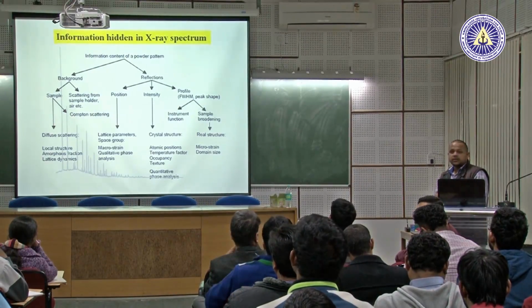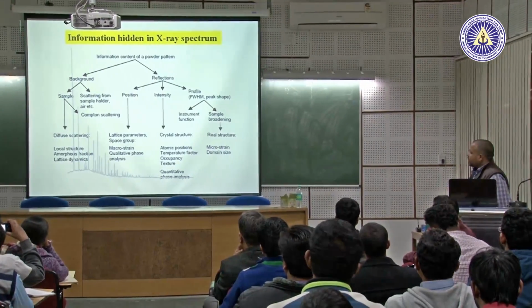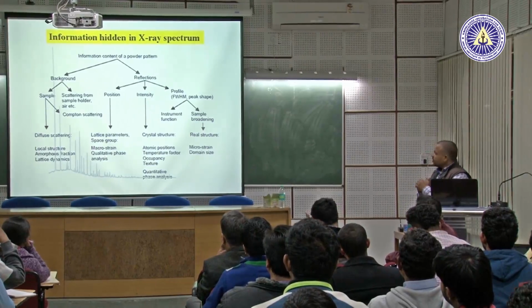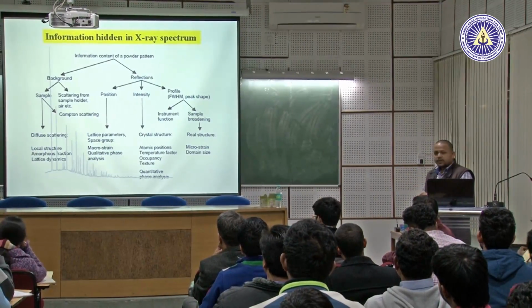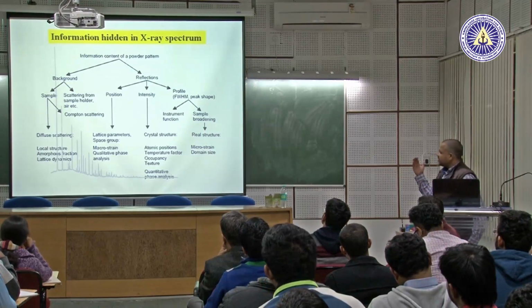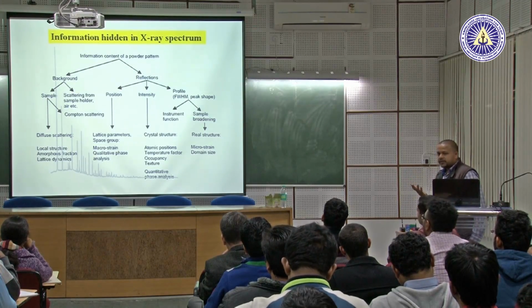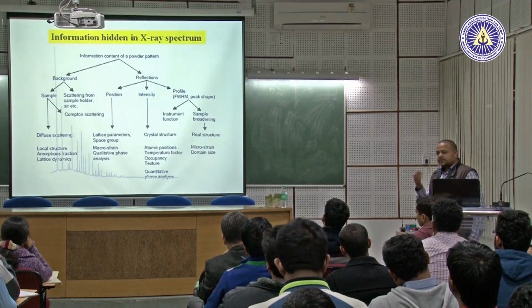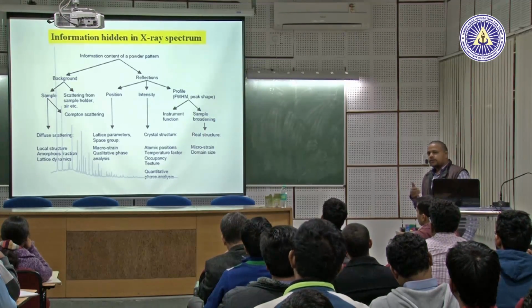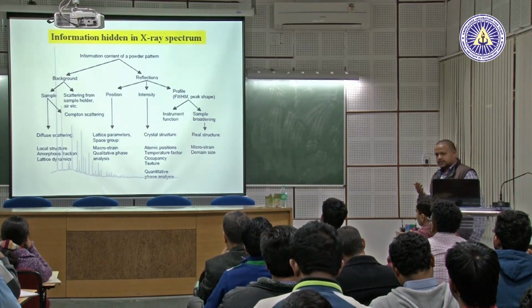In the last lectures, you have got a lot of information about structure and how to get the XRD machine. Suppose you have X-ray data. A lot of information is behind the X-ray data: background, reflection. Most of the time users take the data from the operator, and the operator gives the data with background correction. If you are really interested in refinement, don't do the background correction. Take the data as such as you can.